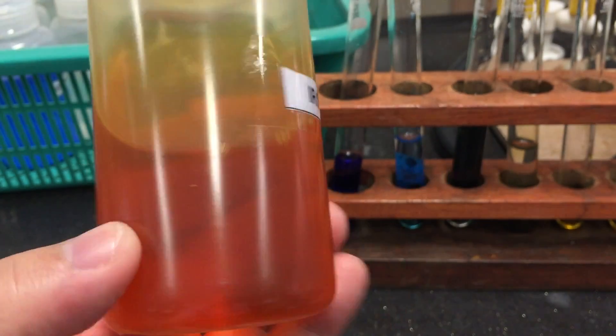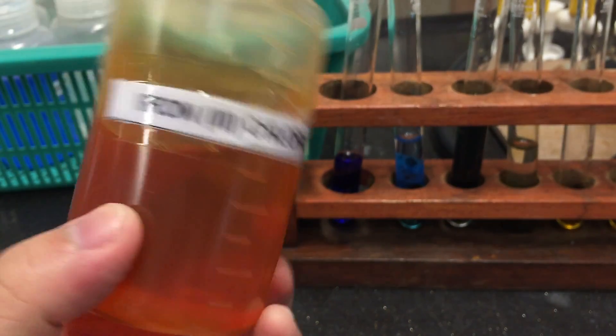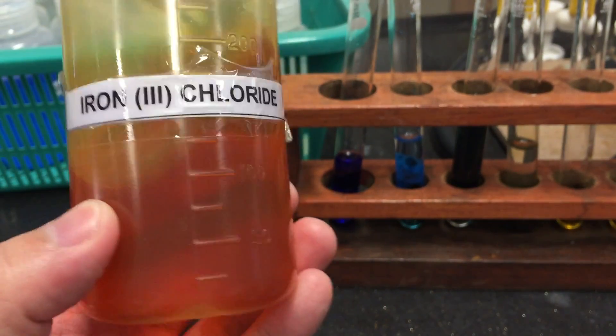Solutions containing iron-3 ions are typically red-brown, orange, or yellow in color, depending on the concentration of iron-3 ions.